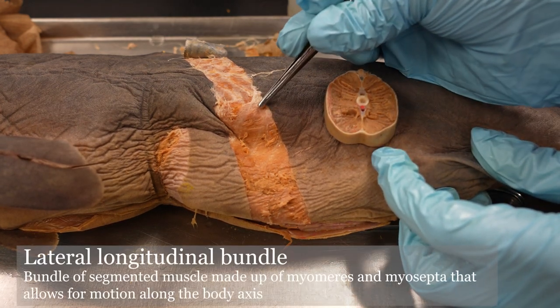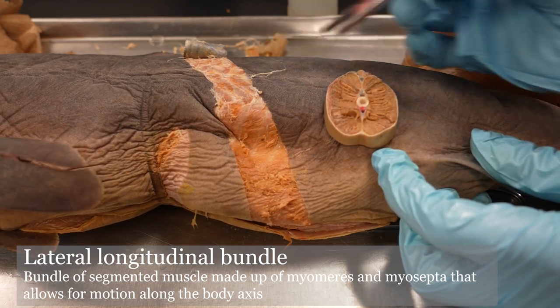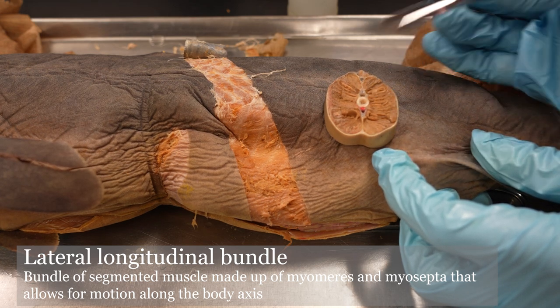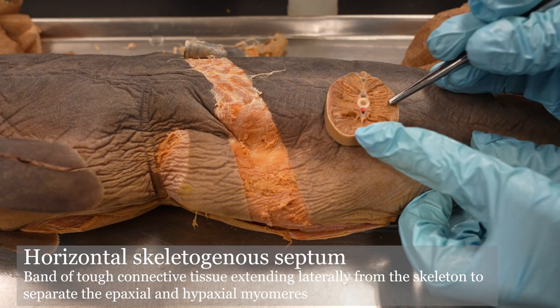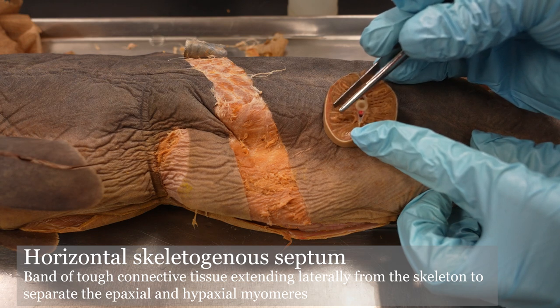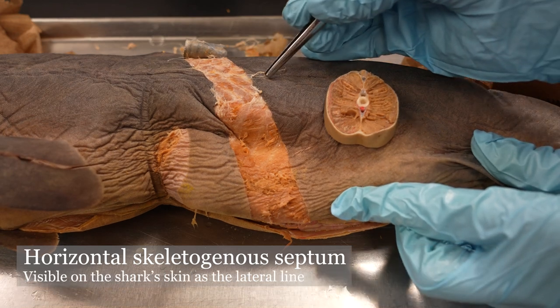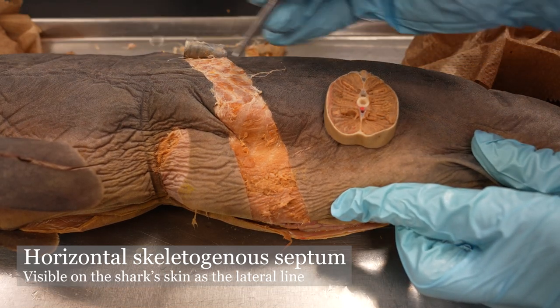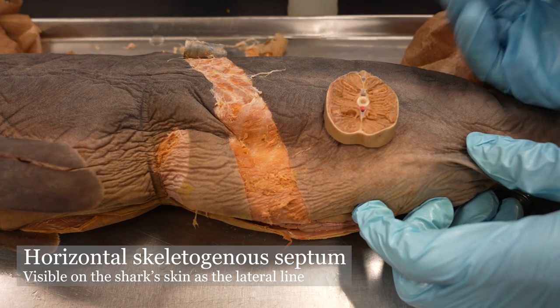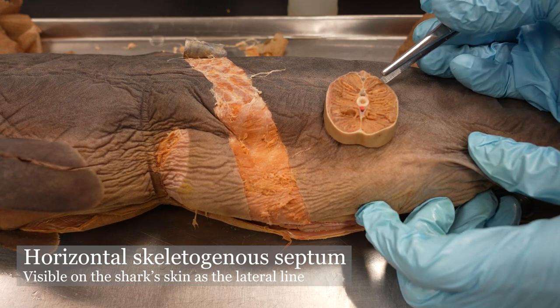Moving dorsally, we have the lateral longitudinal bundle, which is expressed right here on the tail and the cutlet. The horizontal skeletogenous septum is not really evident — well, actually, here's a little bit of it you might be able to see on camera, right there. It's expressed as the lateral line that you can see — it's kind of a lighter gray. We talked about the lateral line in lecture, so you have an idea what that is already for pressure sensing in the water.